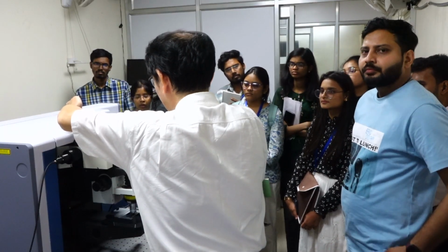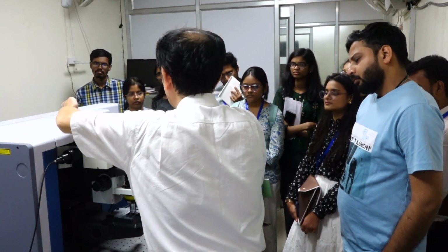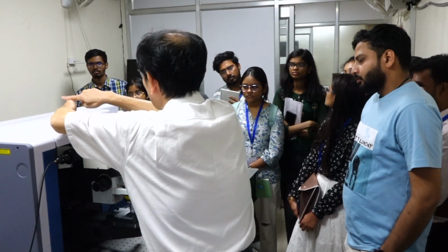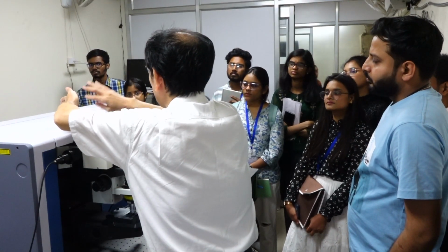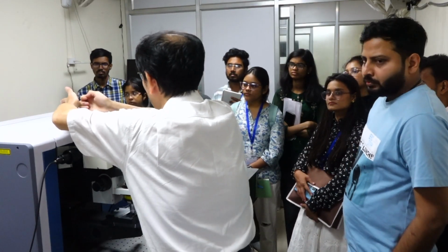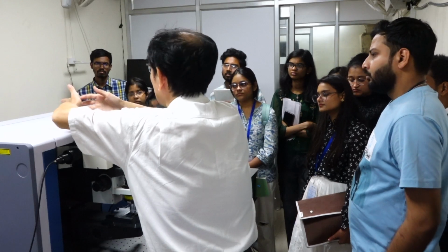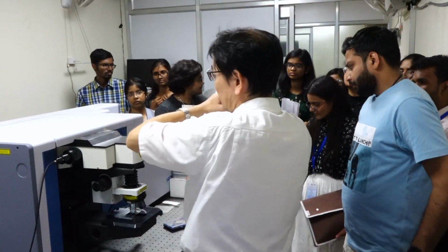Then it returns. Then the reflected 633 and the Raman line reach the dichroic mirror. This element is transparent for 633, so 633 goes back. But this is a mirror for longer wavelengths than 633. So the Raman line cannot go through, but is reflected. So it serves as a separator of the Rayleigh scattering and the Raman line. That is convenient.